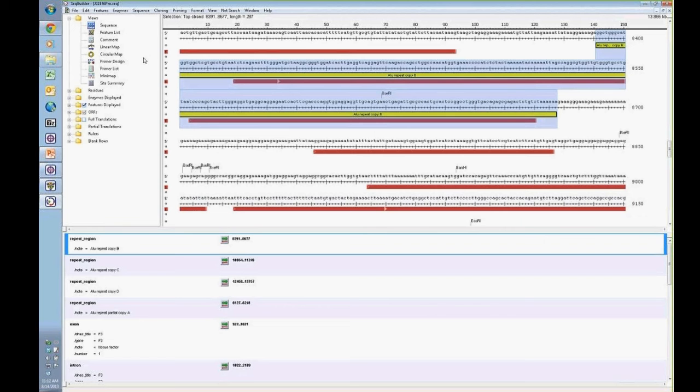As we go through the various views here, there's also a number of folders. For example, if I want to see the bottom strand residues, I can filter by specific enzymes. If I want to look at all the enzymes in the REBASE catalog, I can click on this. I can also sort by features, open reading frames, translations, top strand and bottom strand translations. I can apply annotations in regards to the translation part of it.